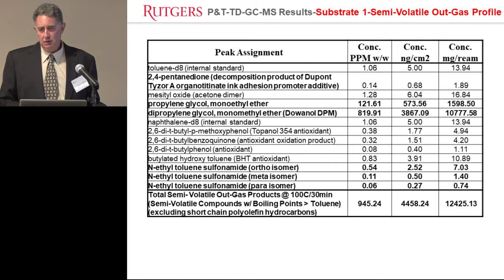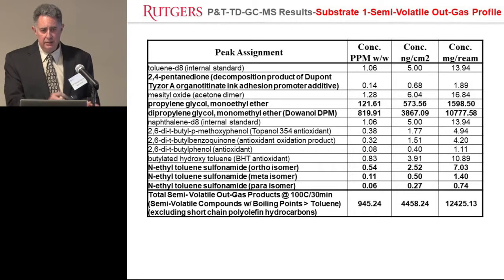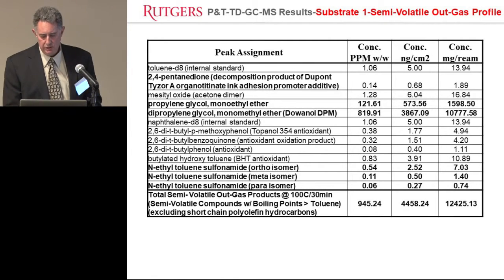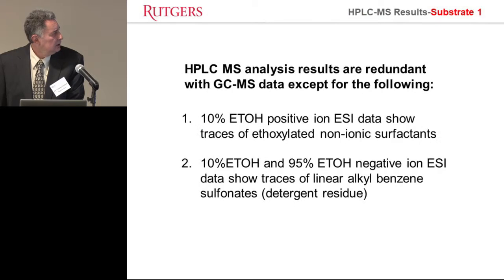The industry standard, not regulatory, but basically what people strive for, is to keep retained solvents less than 1,000 milligrams per ream. So here's one that's roughly 10 times higher. And there's a reason for it. This is probably a laminate, and the ink solvent gets trapped in one of the laminations, and it's really low migration on the food side, but this was measured on the total packaging. So it shows from edge extractables, relatively high.